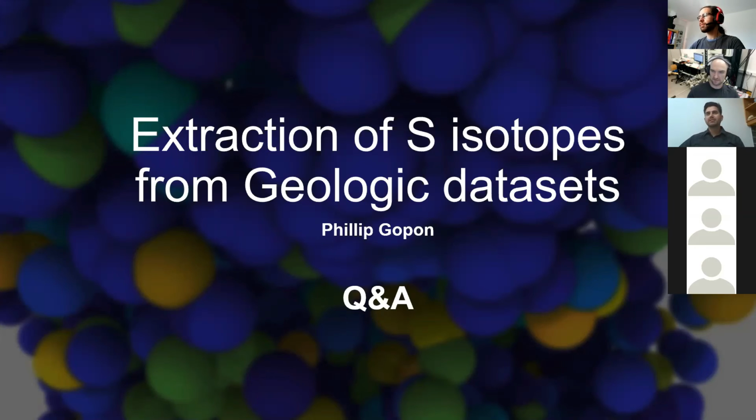This is something that the guys at Curtin have done. This is our foray into this using sulfur isotopes, and very specific systems seem to work and others don't. And I don't want to talk about the lead stuff. That's Steve Reddy's and the other guy's domain. But I think isotopes and being able to do something proper with that is really where it's at.